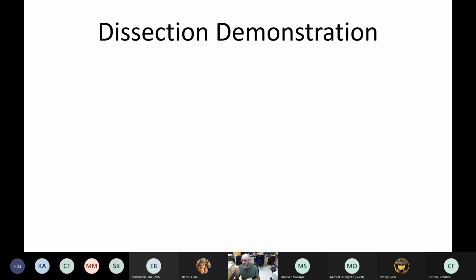But usually within 12 to 24 hours, they're sufficiently pliable. And so actually right now we can take a look and we can try, and I'll show you my little tool that I use, which is just a pin with a burr on it. And we'll see if we can dissect some of these males, a little demonstration.